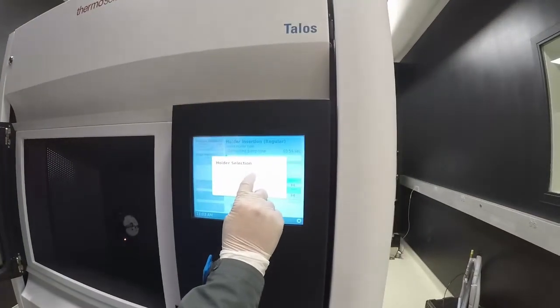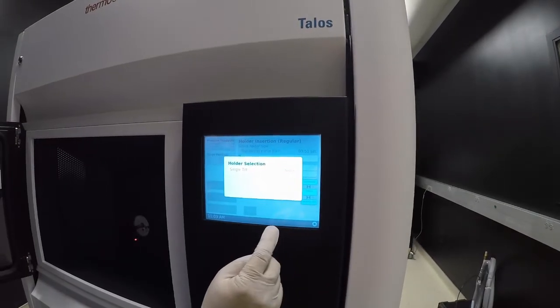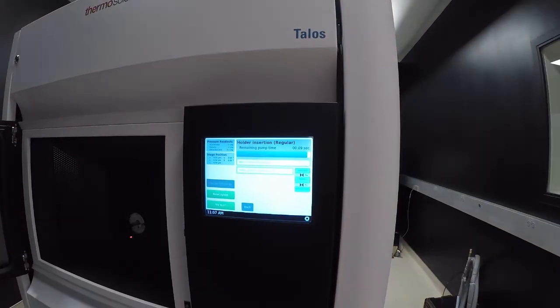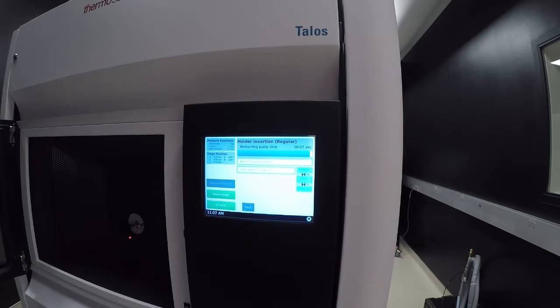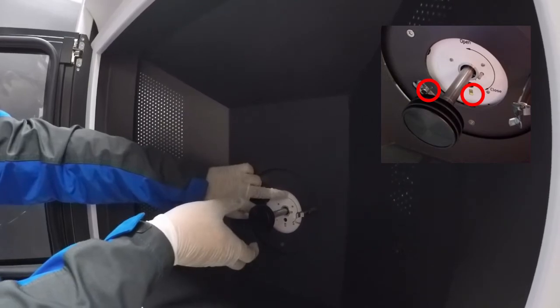On the touch screen you must select the holder type. In this instance, single tilt holder. It will then take a couple of minutes to pump. During this step, vacuum will pull on the holder, so hold it securely.